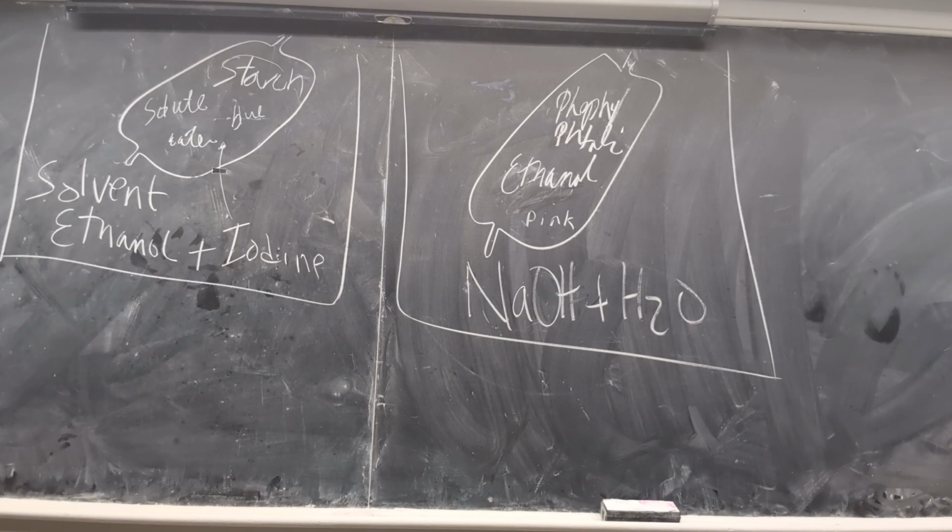Now we need to do the same thing but with different solvents. So get another beaker and use sodium hydroxide on the outside. Put it in the bag, and put the other side out. Use the other bag. Phenolphthalein, yeah. So ethanol, yes. Where is phenolphthalein?